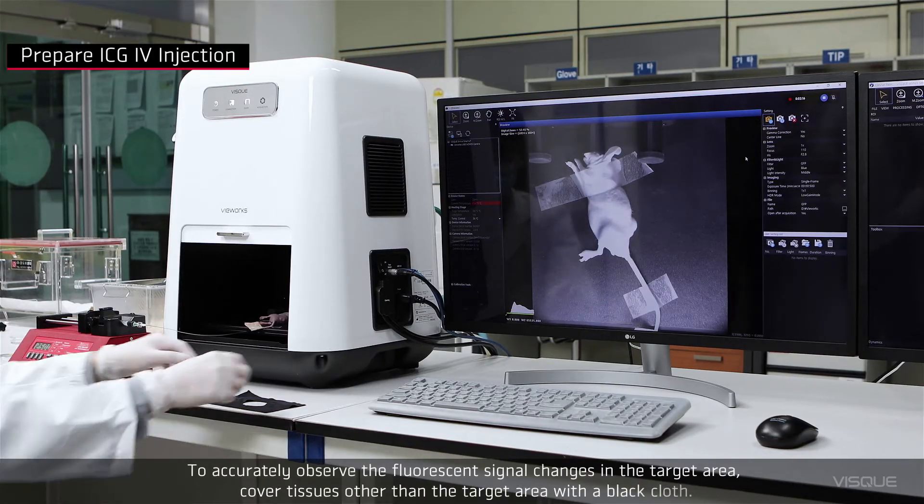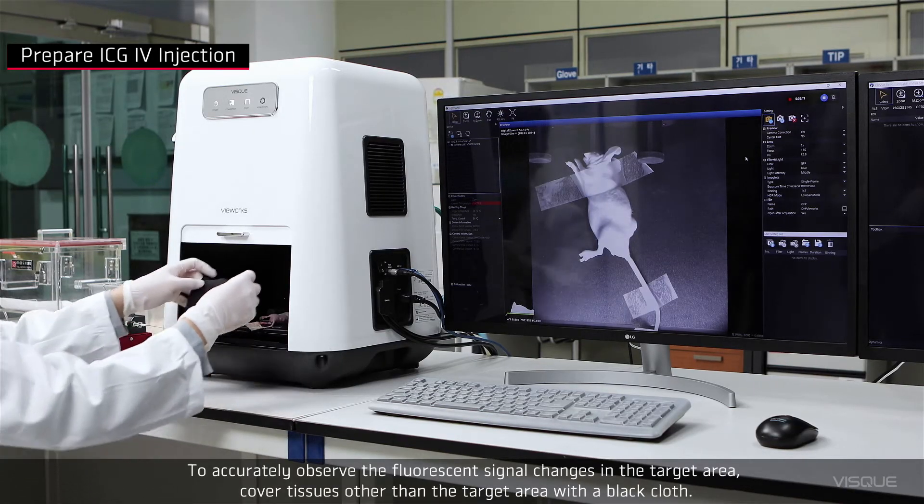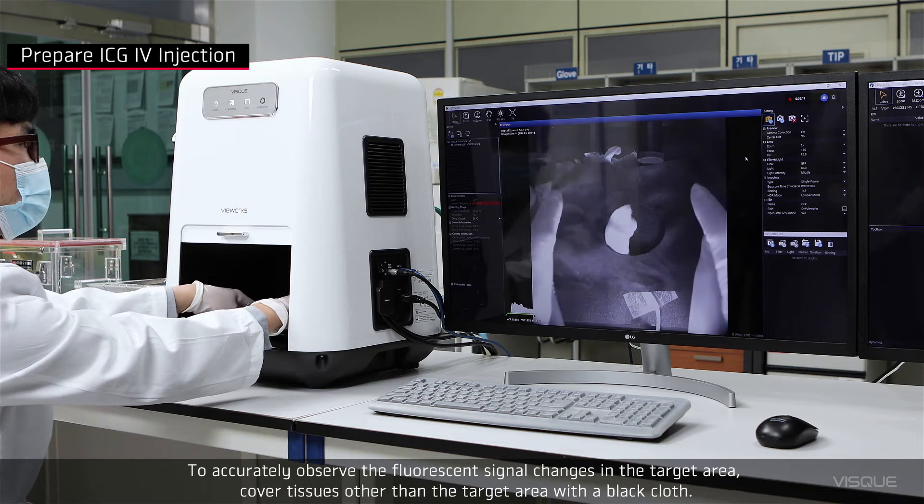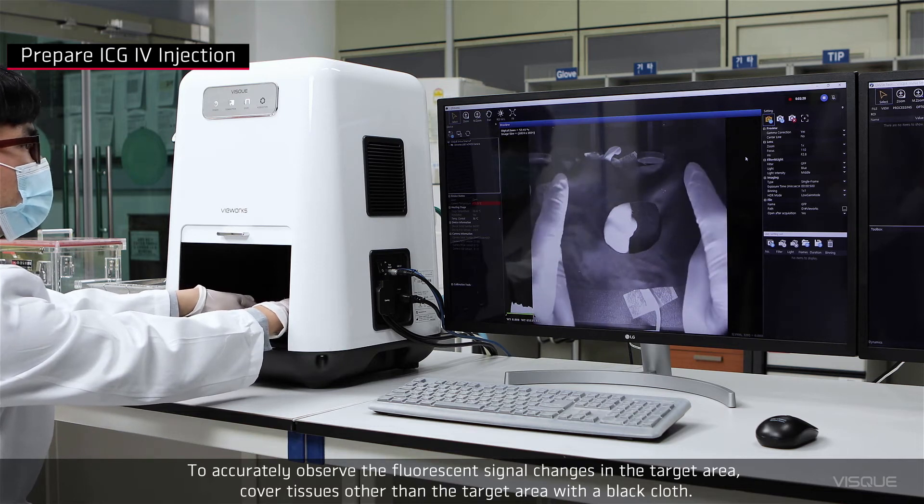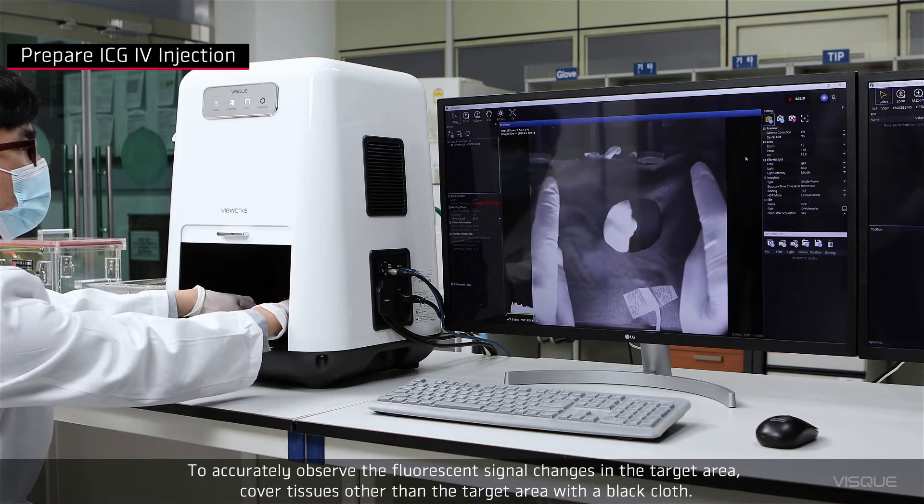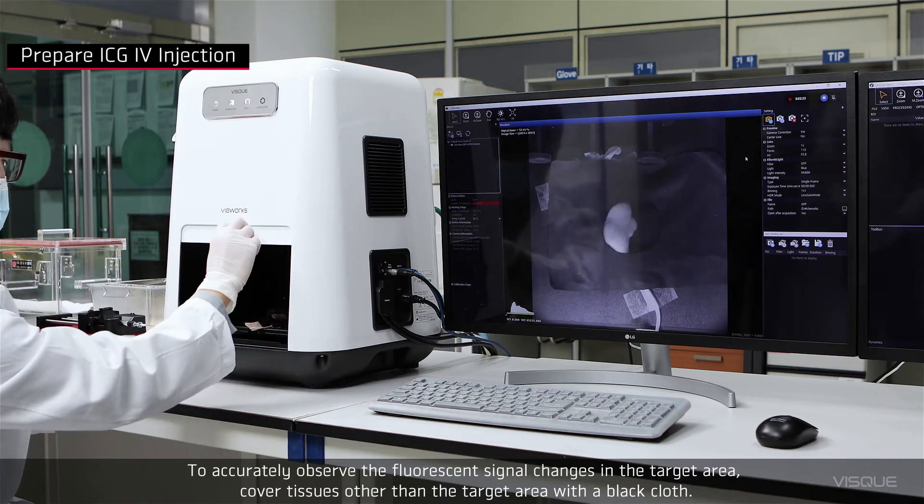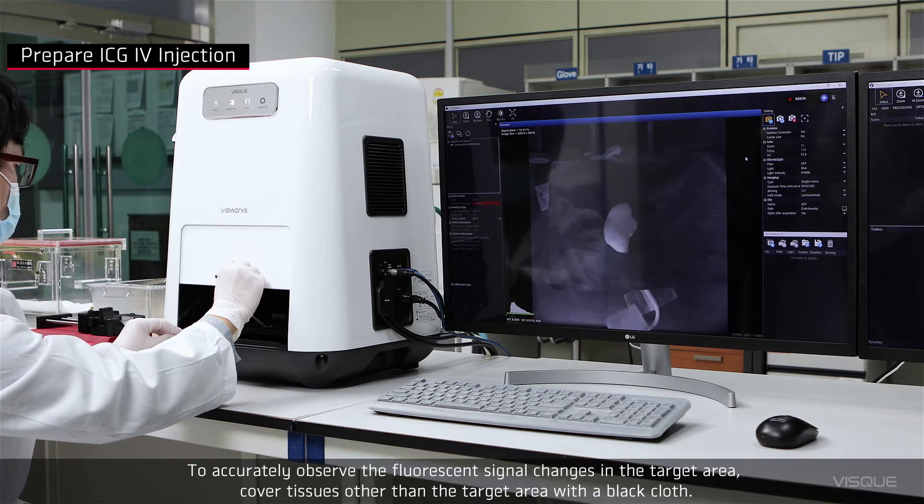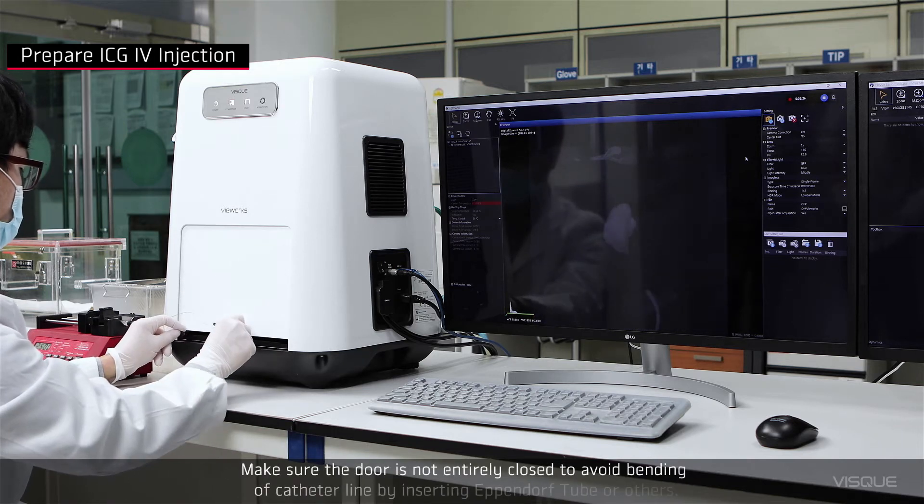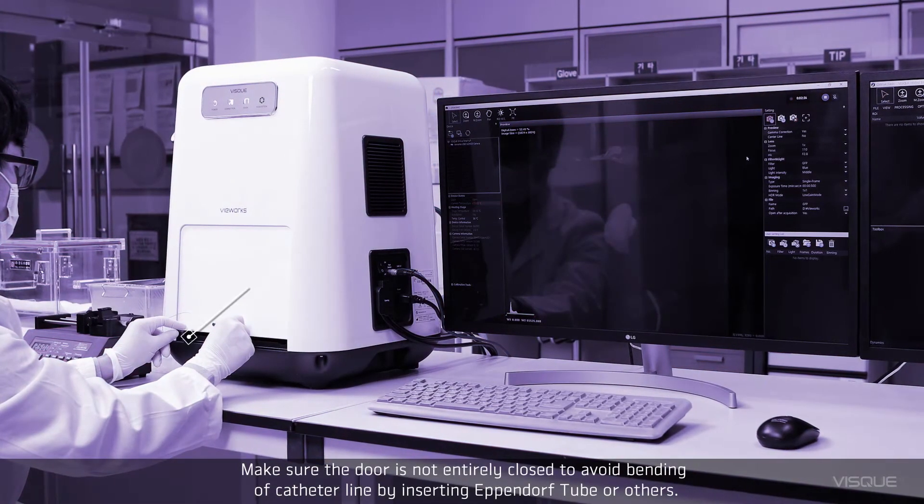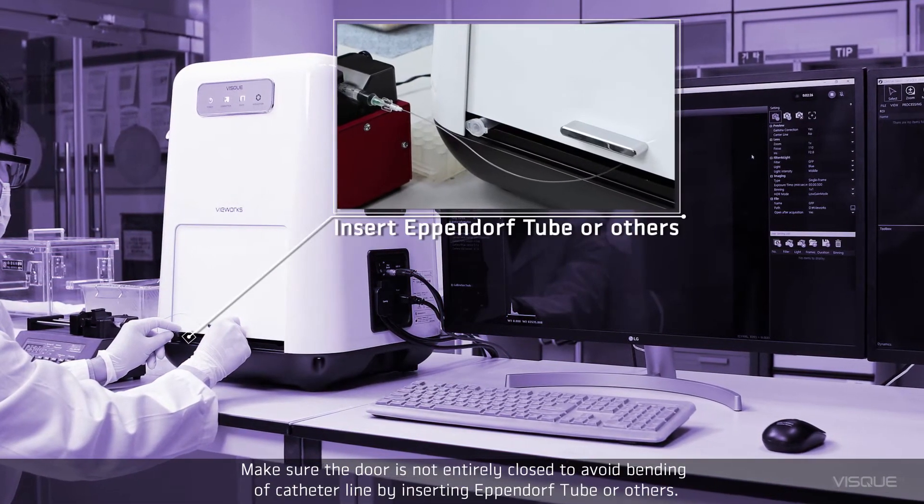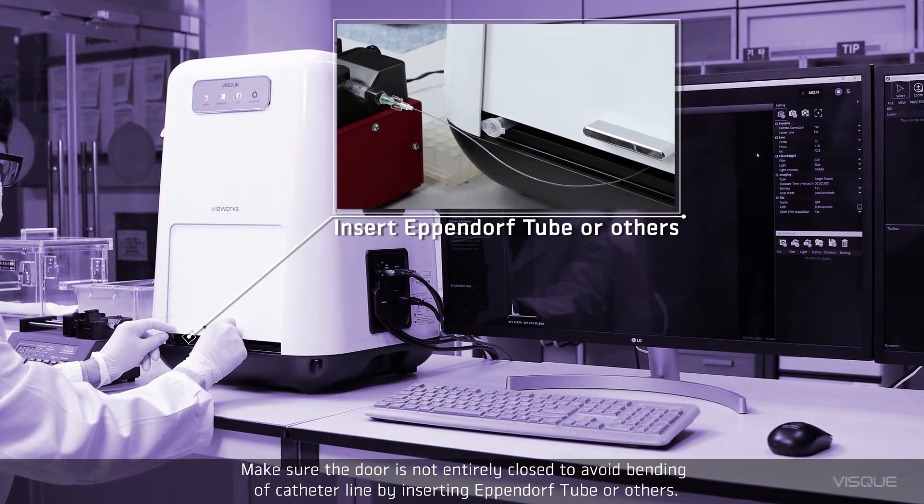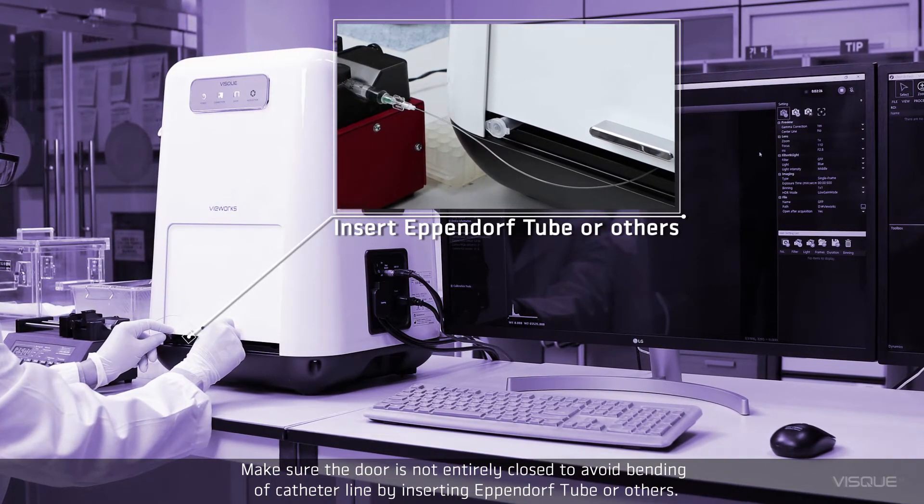To accurately observe the fluorescent signal changes in the target area, cover tissues other than the target area with a black cloth. Make sure the door is not entirely closed to avoid bending of catheter line by inserting EP tube or others.